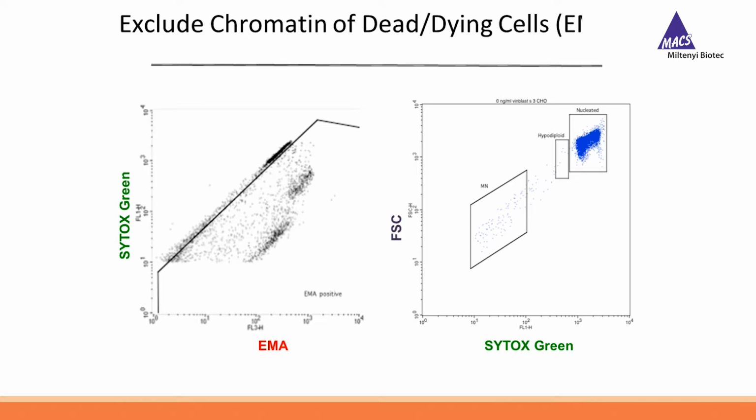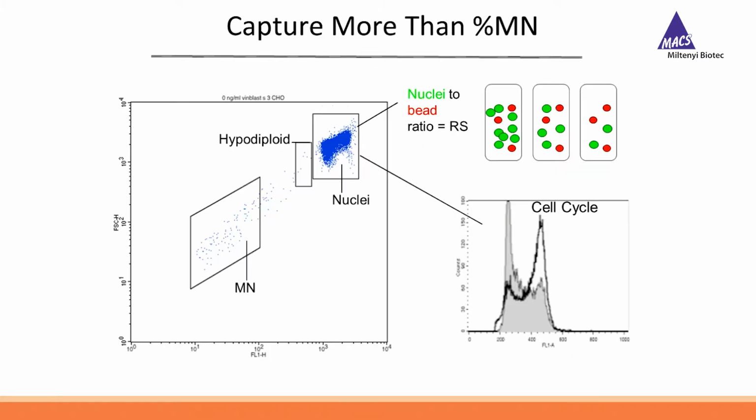Now, that's not the only thing that we get from this. Because flow cytometry is a multiparametric system, we can get multiple types of different information out of that, not just looking at micronucleus formation. In addition to getting those micronuclei and nuclei, which are a little bit more clearly defined here, you can see them labeled, we also get information on those main nuclei to look at things such as cell cycle, which can be significantly altered following exposure to a genotoxic agent.